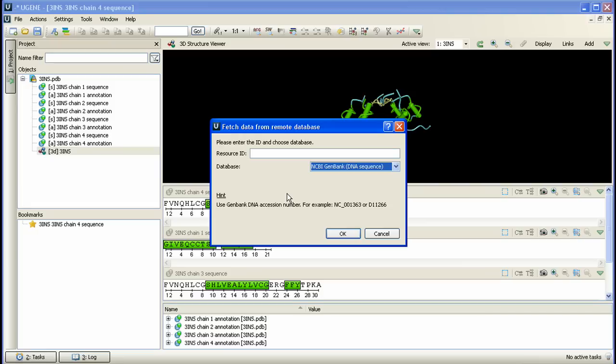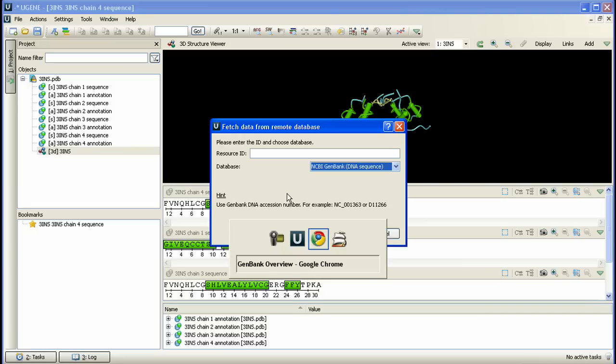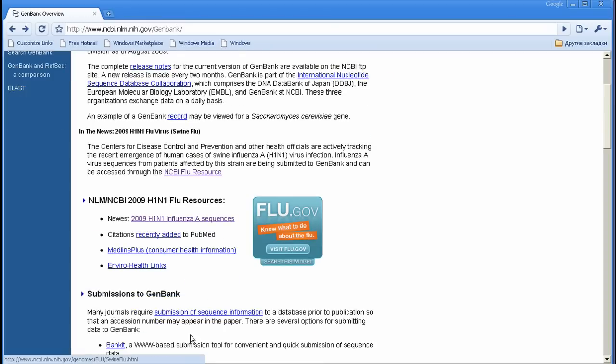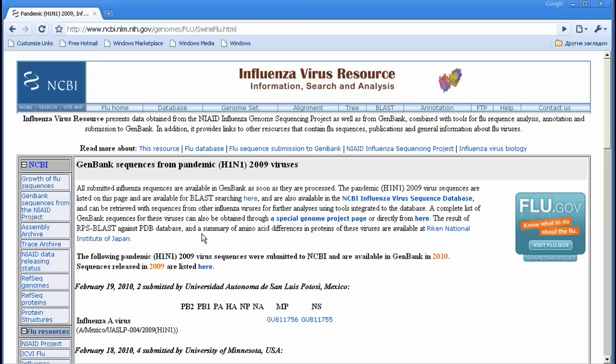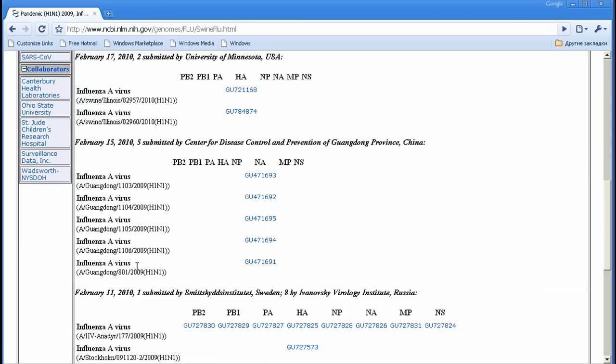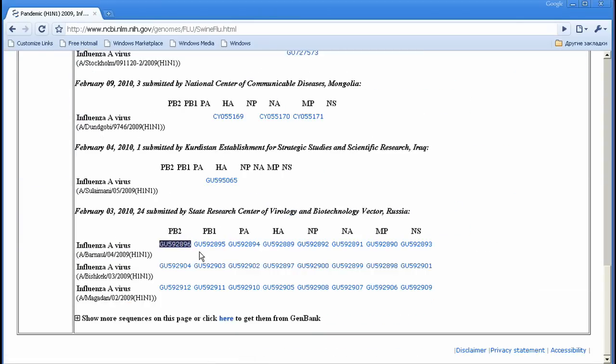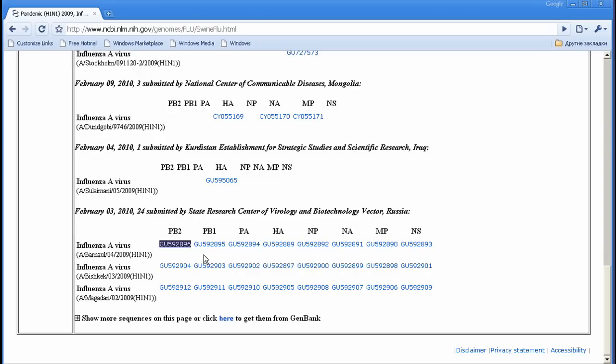We could search the virus gene identifiers at the NCBI webpage. Here they are! So, let's finally open H1N1 PB2 gene in UGENE.